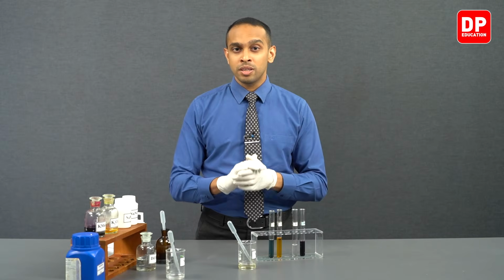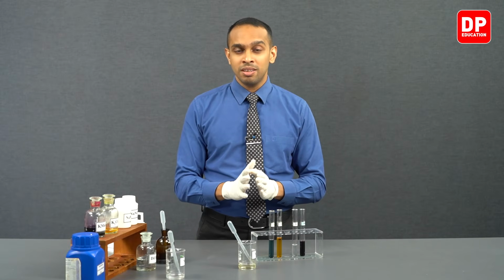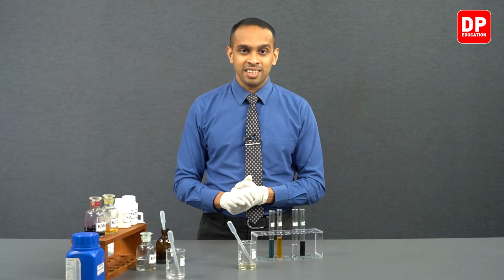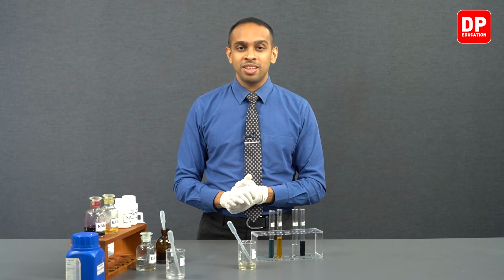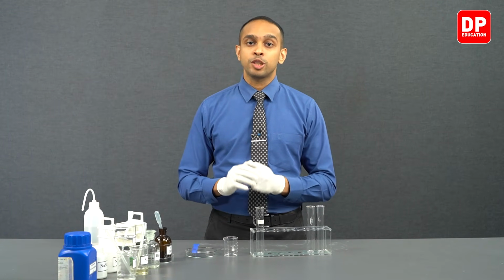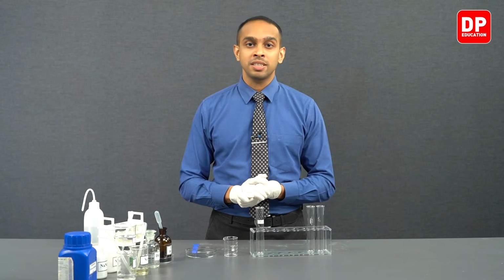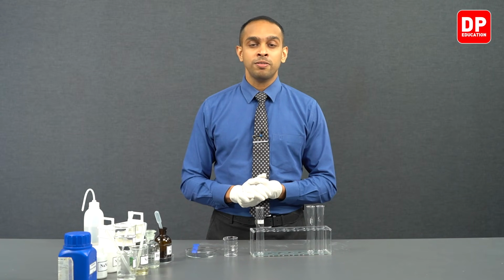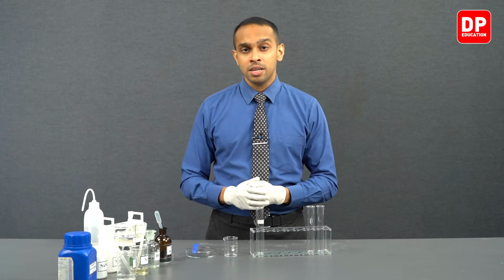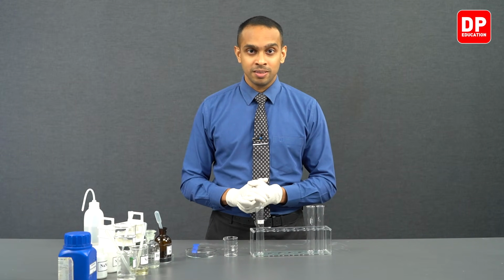So this particular experiment can be used to separately identify between nitrate ions and nitrite ions. Now let's move on to the next test. Now students, we are going to be carrying out a very specific test that we can conduct for the identification of nitrate ions, and this test is referred to as the brown ring test.